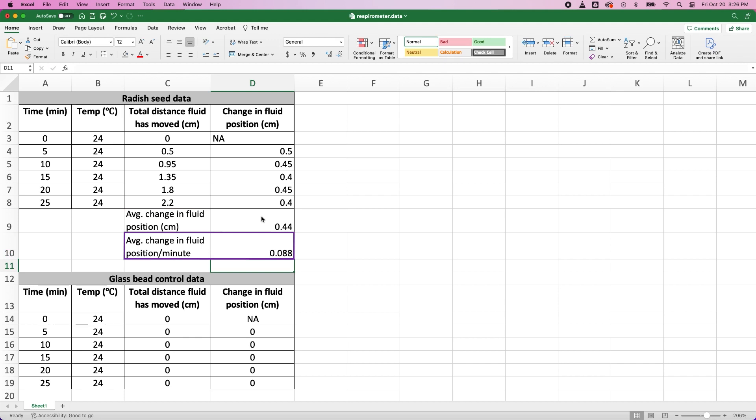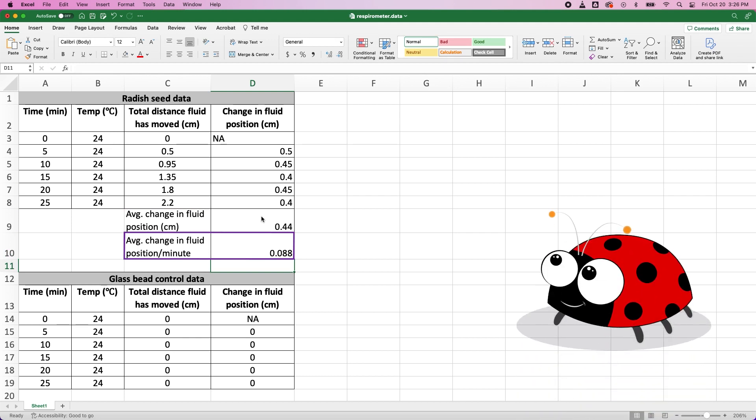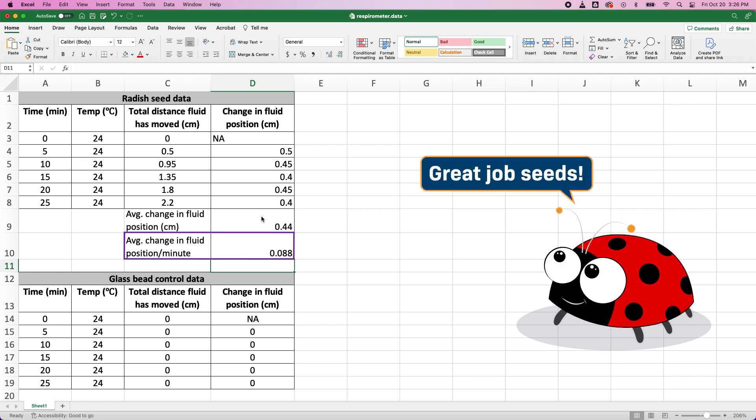My results indicate that my germinating seeds are respiring at a rate of .09 cm per minute. Great job, seeds!